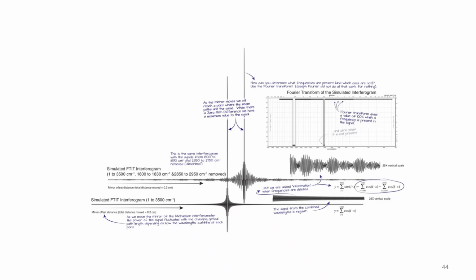The signal detected by the detector generates this interferogram. It can be transformed into the frequency domain spectrum, which indicates the reductions of the signal or the intensity at the respective wave number. By now, you should know how the interferometer works to generate the spectrum from a bunch of frequencies which are simultaneously directed to the beam splitter, and the process of interference occurs to generate the interferogram, which can be transformed into the spectrum that we observe through the Fourier transform, which is the mathematical integration expression.